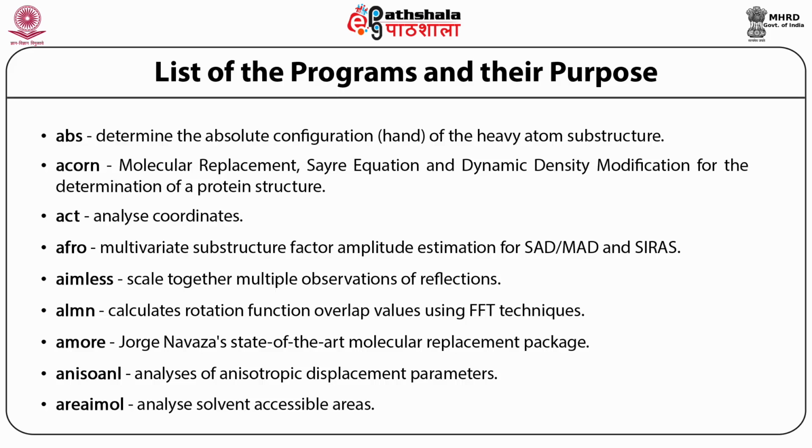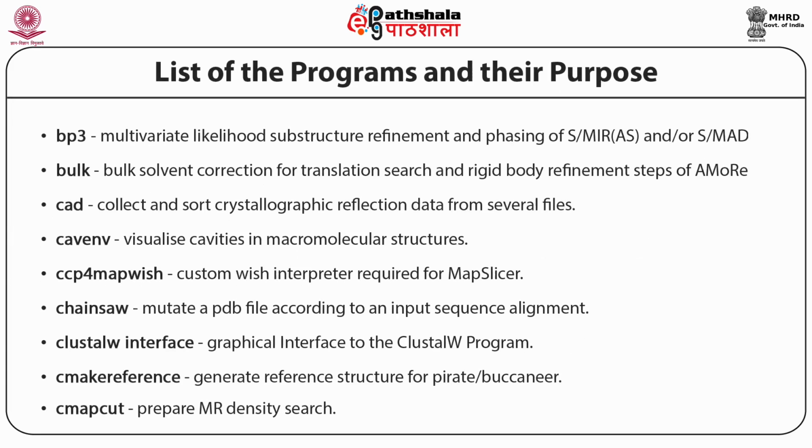So then we have anisotropic displacement parameter analysis with the program ANISOANL and so on. Then for solvent correction we have a program called BULK. Suppose you have the crystallographic reflection data from several files, how to collect and sort.